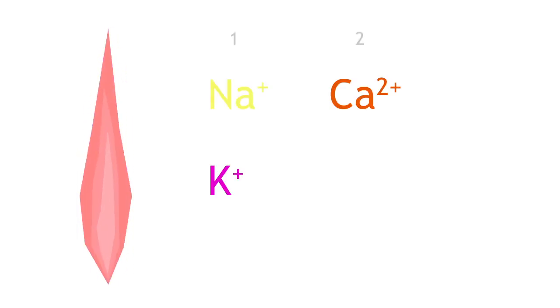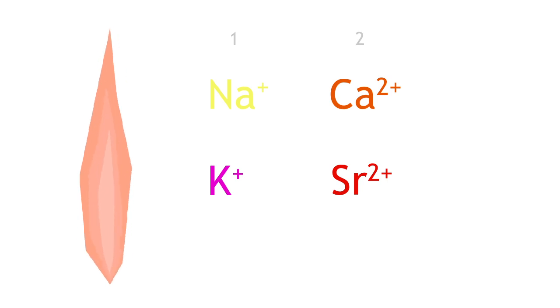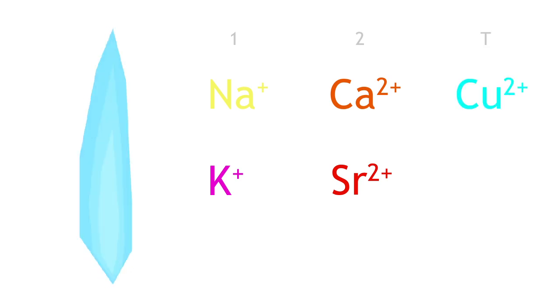This chemistry has made fireworks shows possible around the world. In conclusion, a flame test can be used to identify certain positive ions as they emit a characteristic flame color.